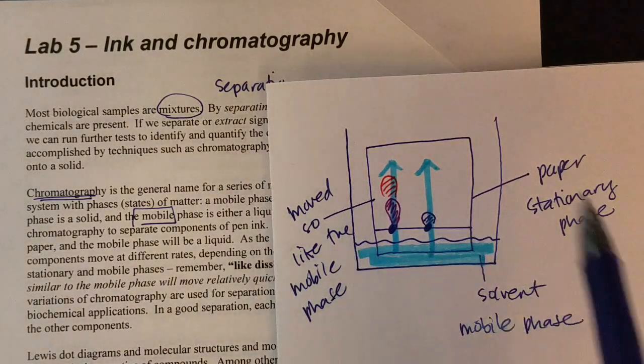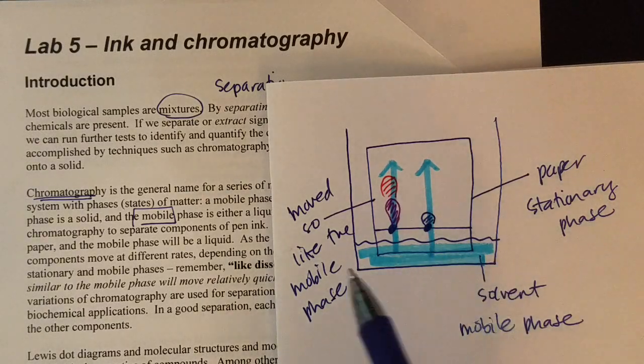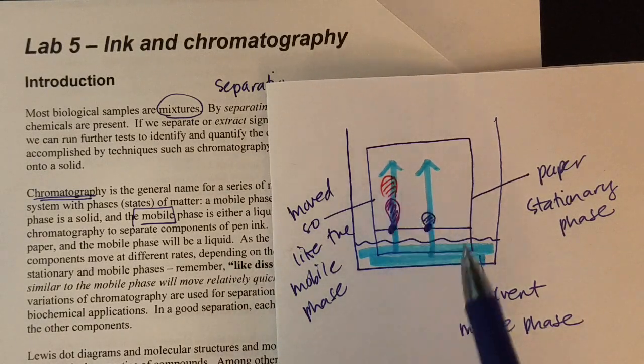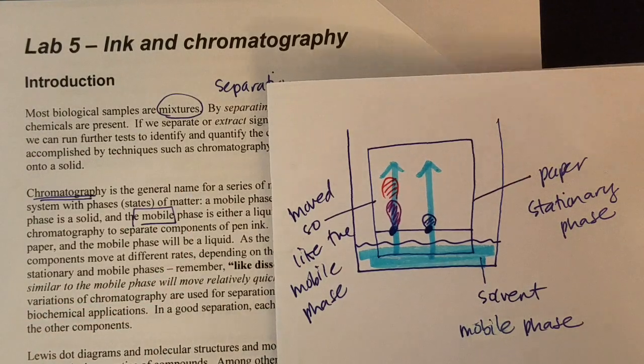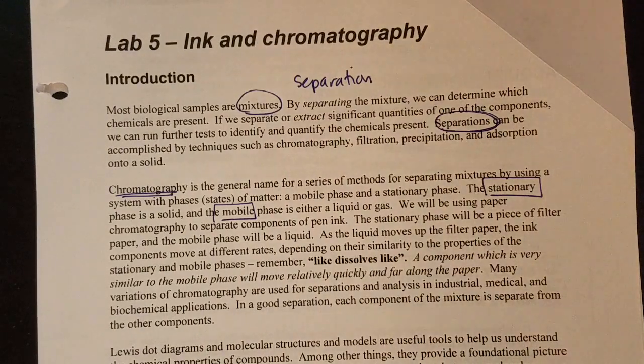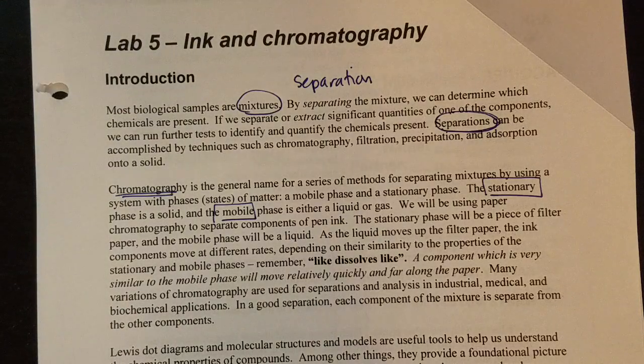So we will be able to differentiate between two inks and also make some inferences about that red must be very similar to the solvent's properties because it moved so much with the solvent. So if we go back to the lab, we're going to be looking for that partitioning or separating between the stationary and the mobile phase as we work through today.